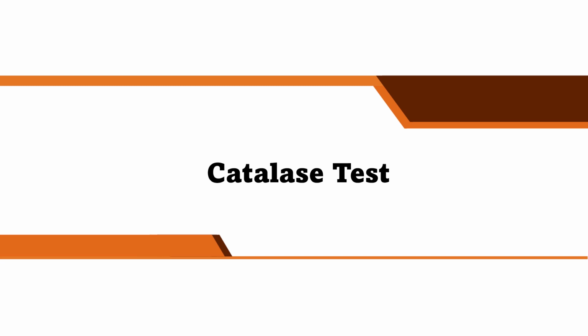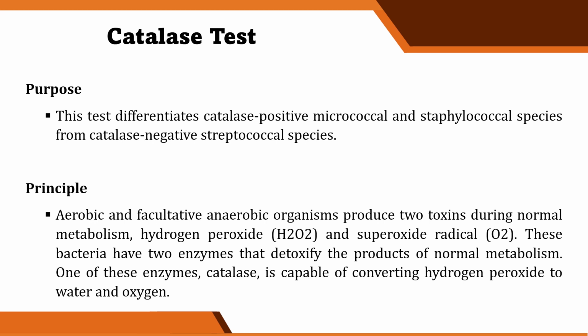So, catalase test. Catalase test is one of the tests we can use to further identify our Staphylococcus species. So, ang purpose nito, this test differentiates catalase positive micrococcal and staphylococcal species from the catalase negative streptococcal species. Okay?